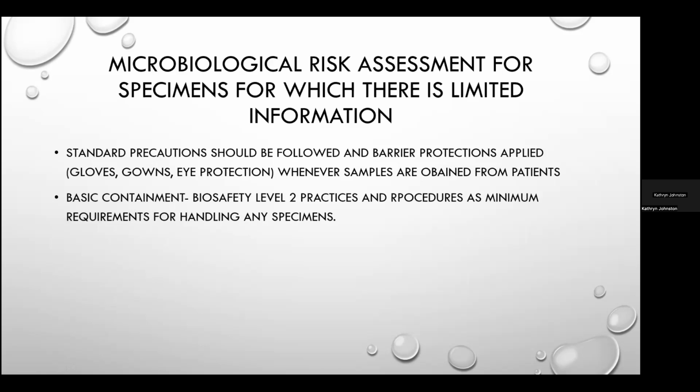And then in those situations where you're dealing with specimens that you don't have a lot of information about, it's good practice to follow standard precautions routinely. And also make sure that you are using at least biosafety level 2 practices and procedures for handling those specimens where there's limited information.